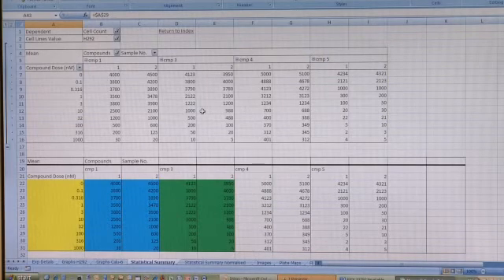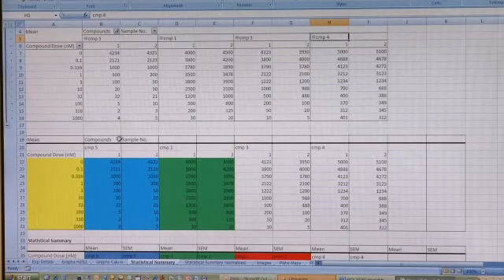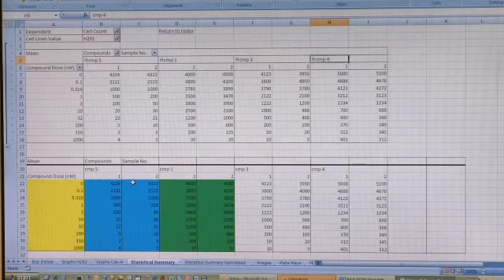Or let's say you want compound 5 to appear first in the table. Clicking on compound 5 in the pivot table and then dragging it to the left reorders the compound list for all the other tables. Remember, these are all advanced pivot table functions, and most of the time you will not need to worry about them, so in general it is best to keep the raw pivot table hidden. I will now do this by pushing the minus key.